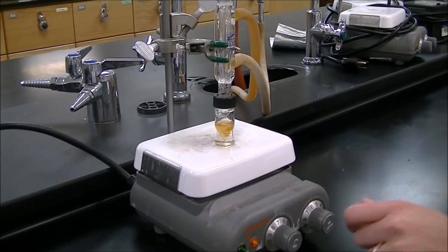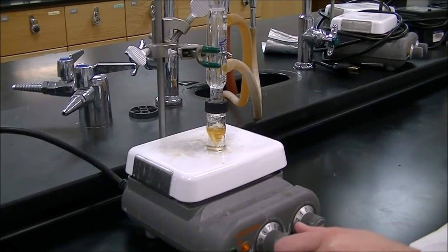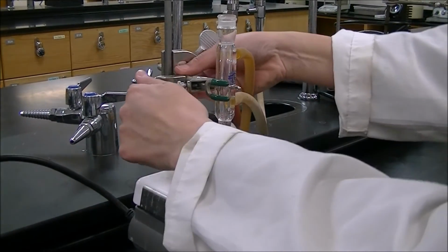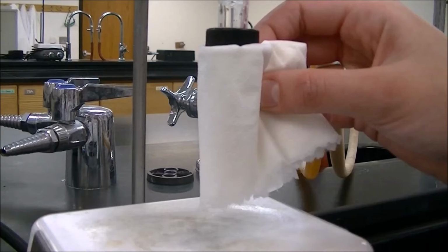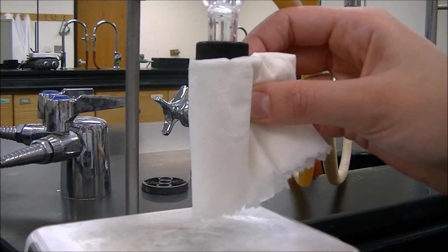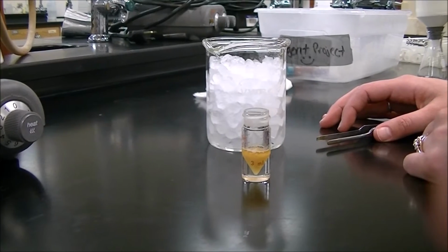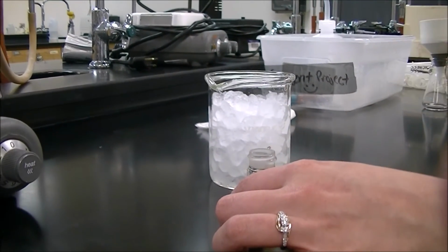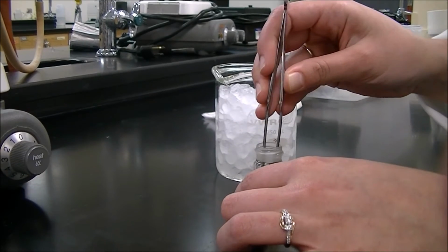After 30 minutes of refluxing, go ahead and turn off the heat and the stir and raise the vial from the hot plate. Use a wet paper towel to help speed up the cooling process. Once your conical vial is cool to the touch, remove the spin vane and add the vial to an ice bath.